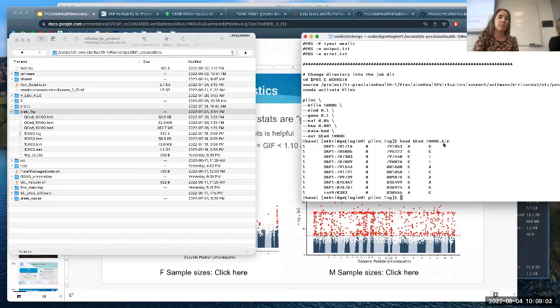For sure. I'm going to show people what two of the PLINK formats look like. A BIM file has the genotype level data. On the left, they don't have column headers, but if you search PLINK BIM, it'll go into detail. This is chromosome, this is the RSID. This is something that is arbitrary and not necessary. This is the base pair, and this is the major and minor. As you've noticed, there's ones that have RSIDs here, and then there's a random SNP. This is because we're using 1KG, 1,000 Genomes, as our example data set. But please note that whatever individual level data you have, this will be different.